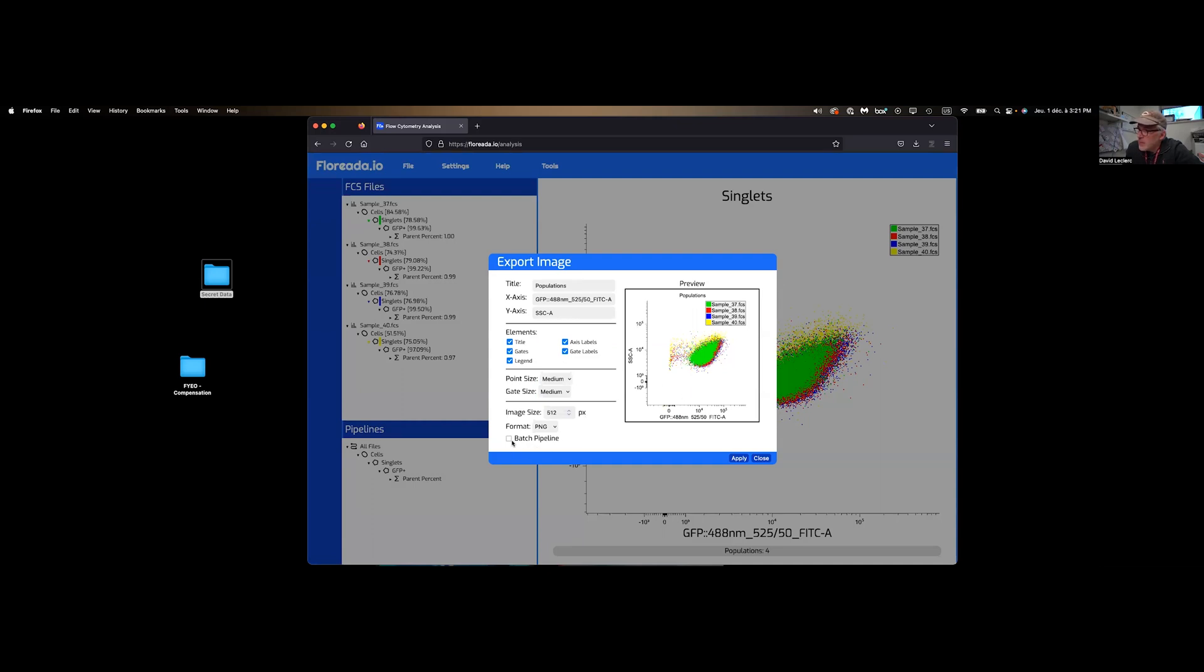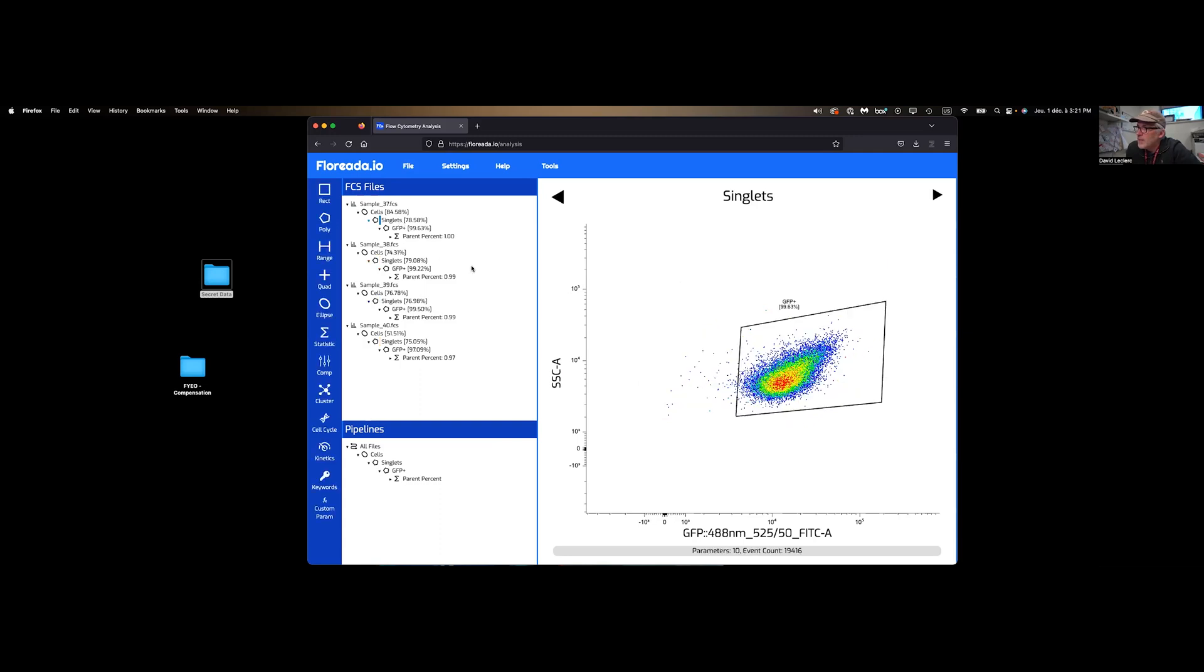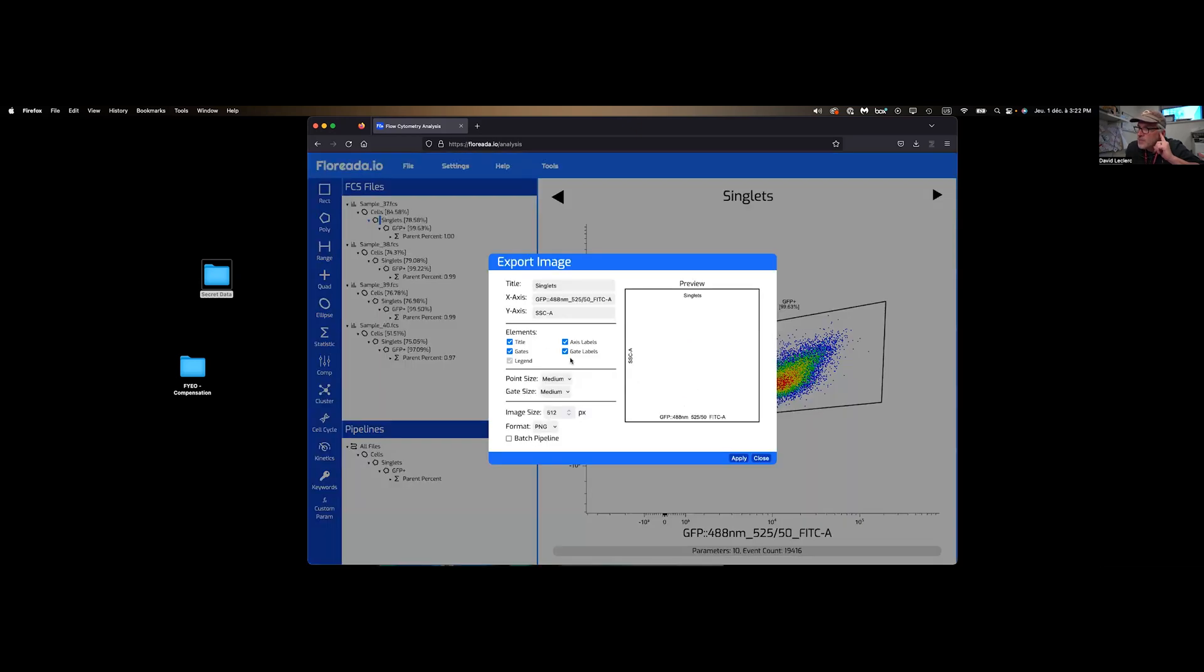There's a batch pipeline here that I want to click. If I just want my files separated on every figure, I can't access that through pipeline. So what I need to do is go back to FCS files, select the gate I want to display, click on save image. Now I can batch this pipeline and change the current parameters of this figure. As you see fit, click OK.